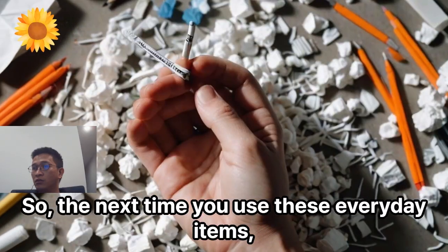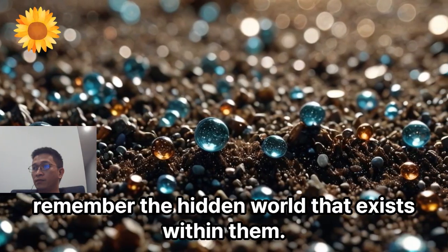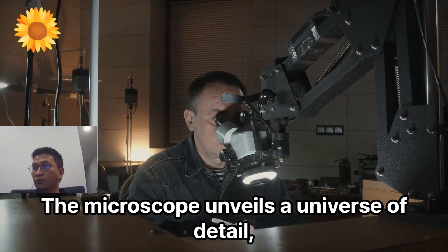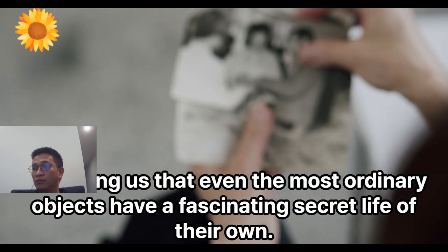So the next time you use these everyday items, remember the hidden world that exists within them. The microscope unveils a universe of detail, reminding us that even the most ordinary objects have a fascinating secret life of their own.